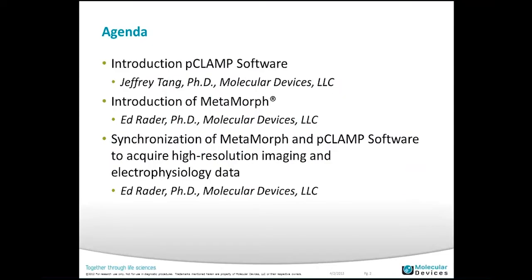Today's agenda is that I will talk about the introduction of pCLAMP software for about 15 minutes, and Ed Rader, our application scientist, will talk about the introduction of the MetaMorph software, and he will also talk about how to synchronize both software for your recording.